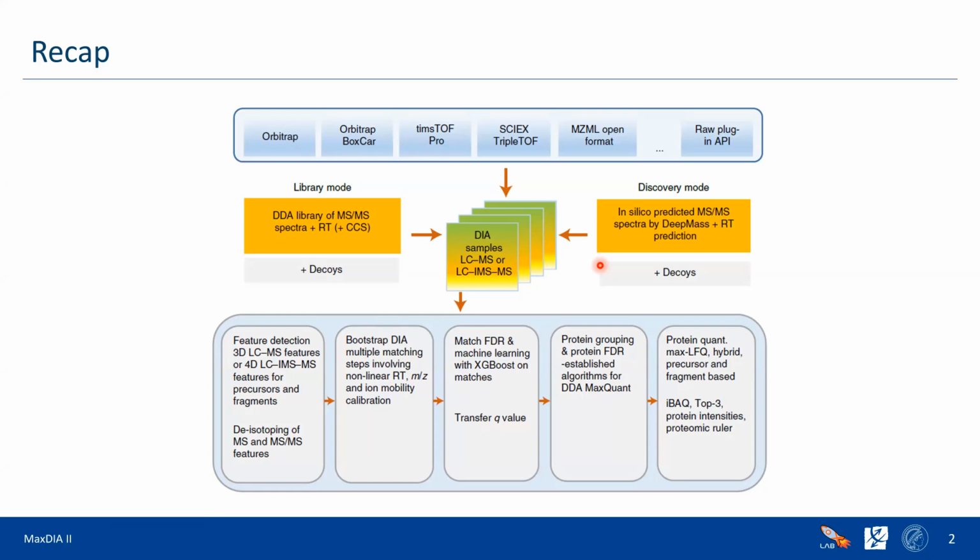What's more, we found out that it is an exceptionally good idea to do bootstrapping, in the sense that it's equivalent to what we do in MaxQuant DDA, where we take a first search and a main search to improve the quality of searching through the database. But also in MaxDIA, we're using Bootstrap DIA, which also improves the search step by step. And of course, we also know that MaxLFQ is exceptionally good for relative quantification, and this is what it would be nice to transfer to the DIA world.